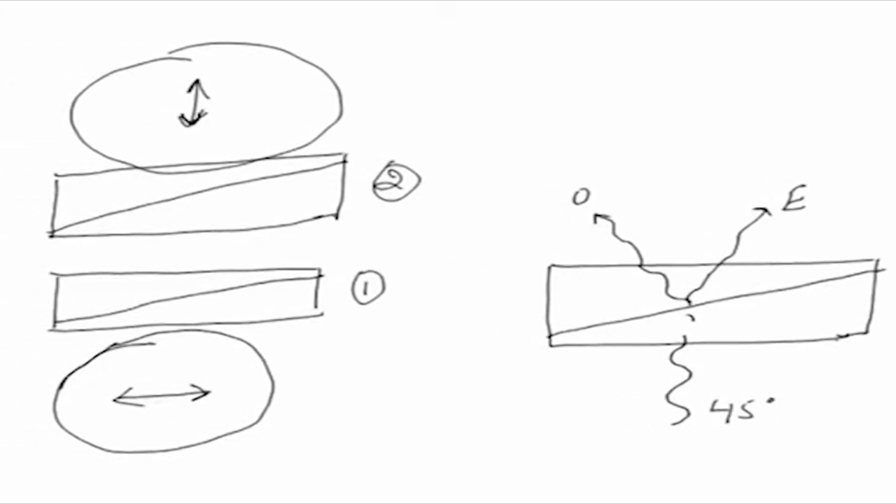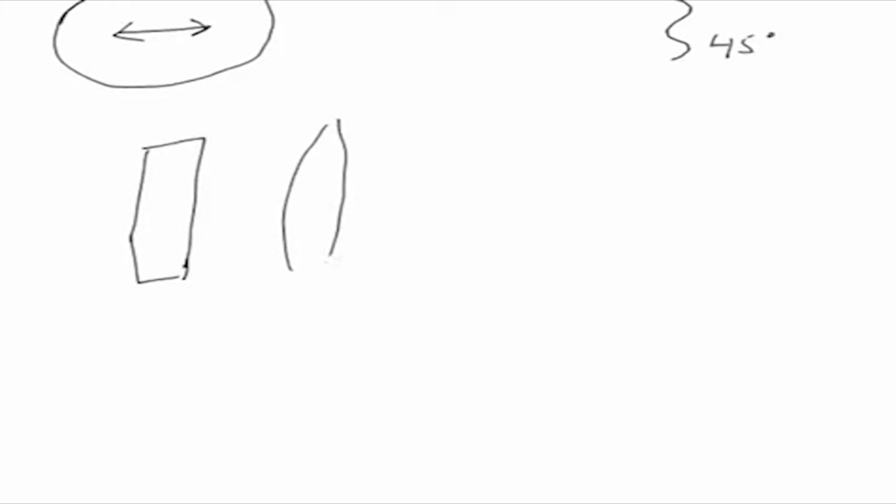Now, if I would like to show this in a different way, suppose there is a prism here and a condenser lens which will be focusing the light. The light comes in here and is divided into two, and the adjacent light enters the condenser and is focused onto the specimen plane.